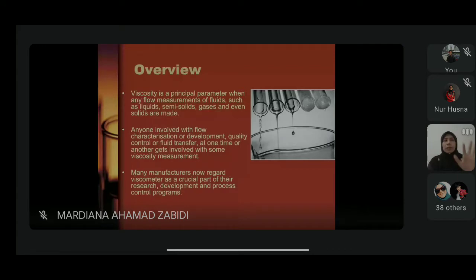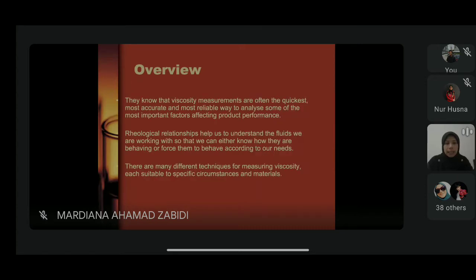Alright, so now many manufacturers regard this viscometer as one critical part to be measured to ensure that their product is consistent. Because we do not want to produce, for example, kaya spread that last week is very viscous, this week is very liquefied, and the following week is according to the specification that we want.